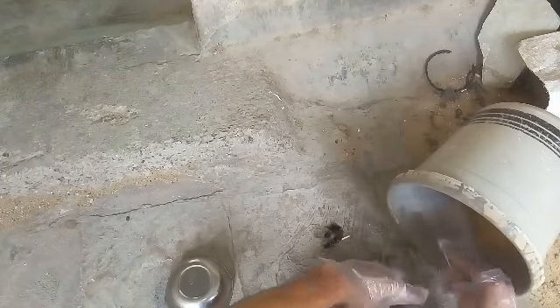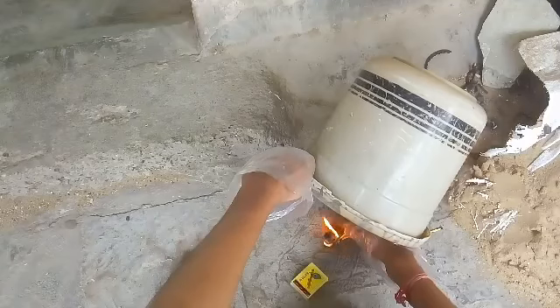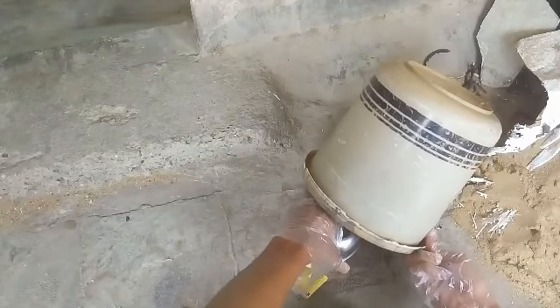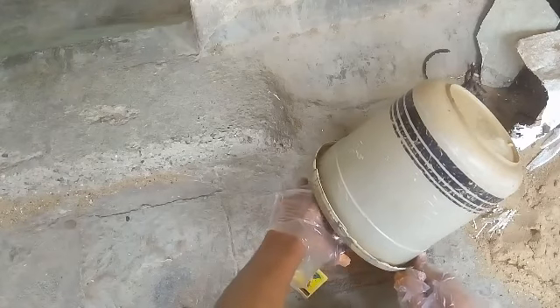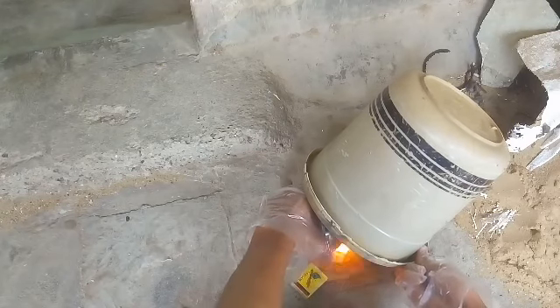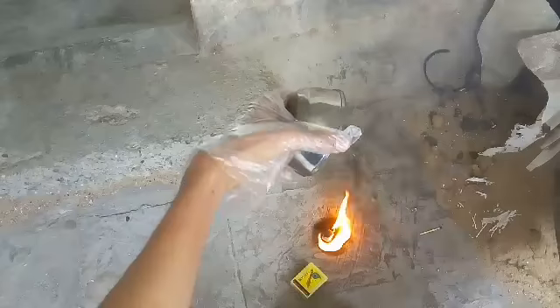So I'm doing it again. Here, get that ignition and be fast. I'm gonna cover it so that the flame don't go off, and collect all the black fumes with it. I know you can't see what's going on in it, but I can't show you it right now because it's very windy. But collect all the smoke come from it, you will see lots of black stuff will come out. See, as the reaction goes very vigorous, and in the cup you can see it blacked.